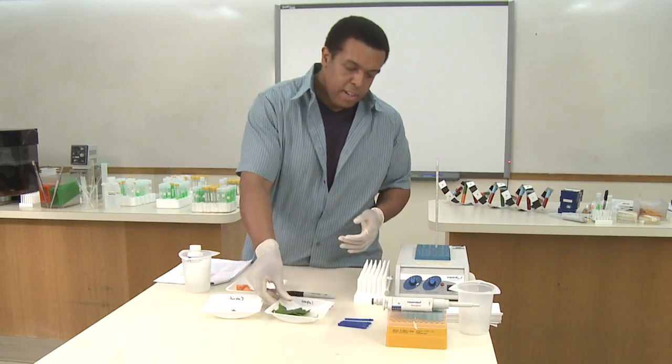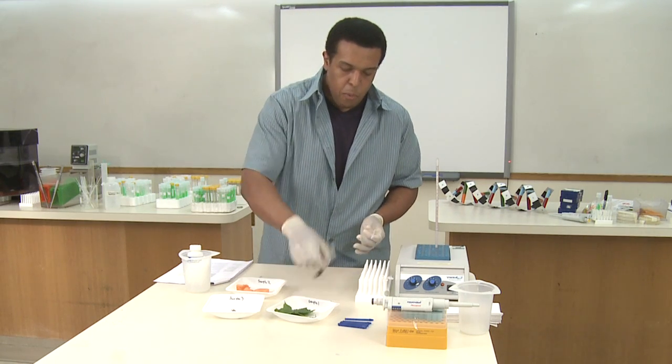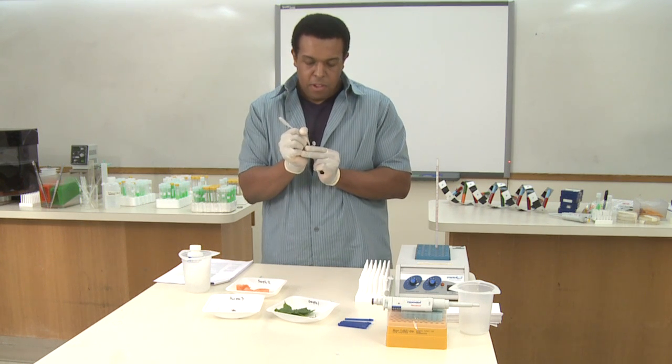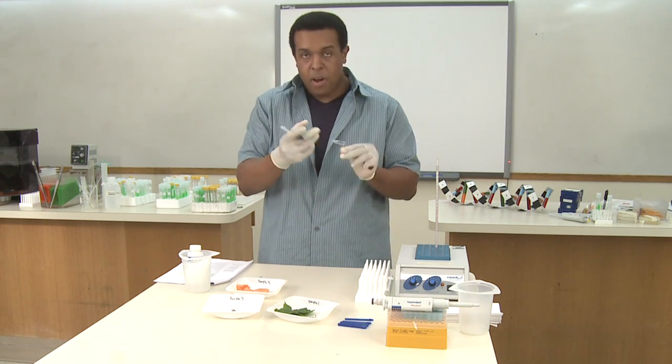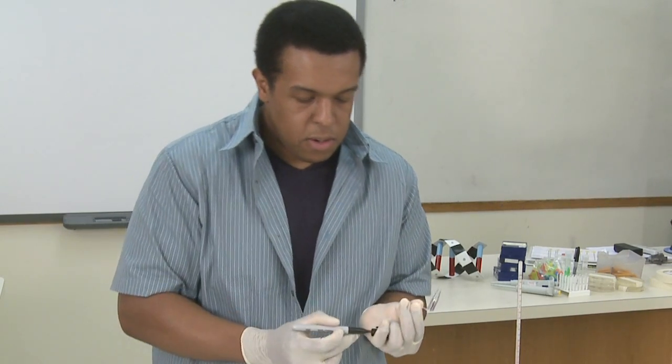You'll need one tube labeled for each one of your samples. When you label your samples, I'm just going to use a Sharpie — give them the designation. I'm calling this one sample one, giving it the date I collected or processed it, and I want to label it on the side as well as the top of the tube, just so I can always be sure.